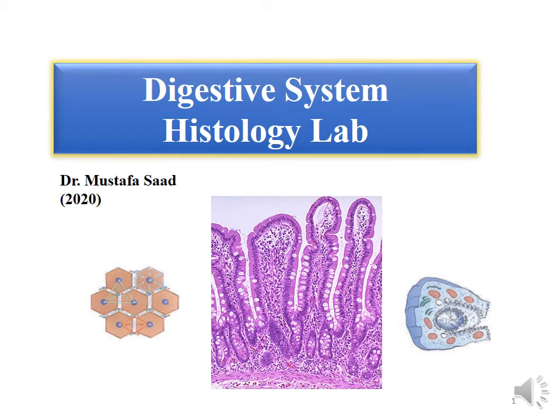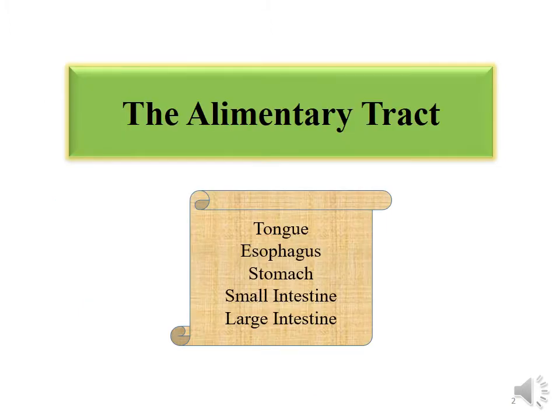Welcome, student, to the Histology lab of the digestive system. In this first part, we are going to talk about the histology of the alimentary tract, including the tongue, esophagus, stomach, the small and the large intestine.